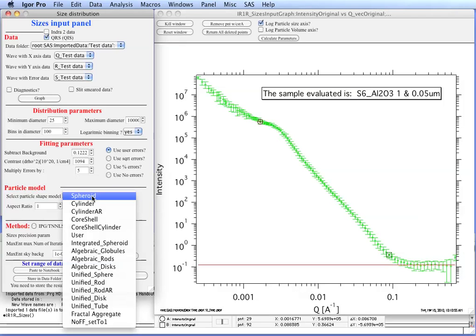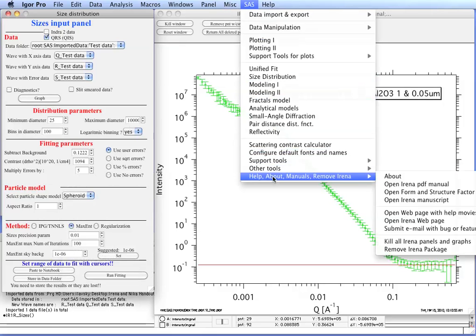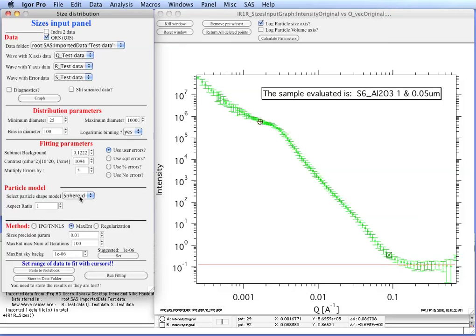Particle model - there's a number of particle models available. You can read about them in an attached available PDF file. The file is available from selection here. You can see there is a PDF manual, form factor and structure factor description, which is where you would find the description of these shape models. So, the spheroid is a reasonably good choice. Most of the particles are considered spheres, which is easy to calculate in small angle scattering. In this case, they are probably fine. Aspect ratio 1 is going to make a spheroid a sphere.